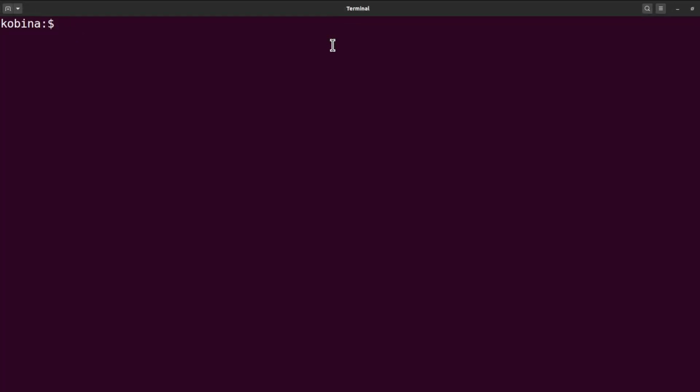I'll open my terminal here and then I'll call the script. So I'll say Rscript, and then I call the script itself, the file name. I have to specify it and I'll also specify the IDs. Okay, so this IDs is a text file that has the Ensembl IDs. If you also have your Ensembl IDs, you can just specify that here and then you just run it like this.